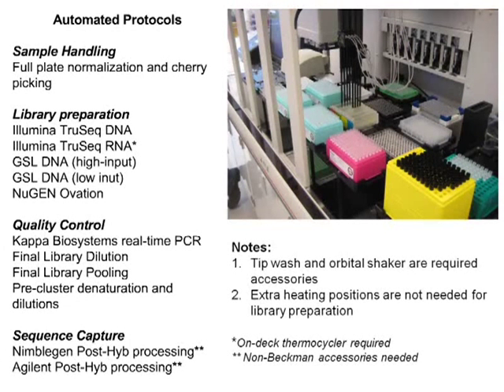We've done the direct comparisons between room temperature or 30 or 37 degrees, depending on the particular step, and there's absolutely no difference at all in performance. The other key thing is for the sequence capture technologies, we do have some non-Beckman accessories that are needed for these particular schemes, specifically to keep buffers at appropriate temperatures. Those came off of Beckman.